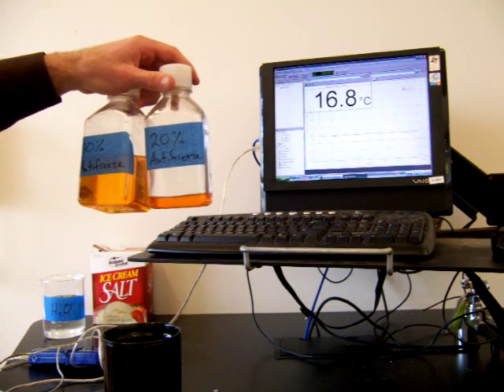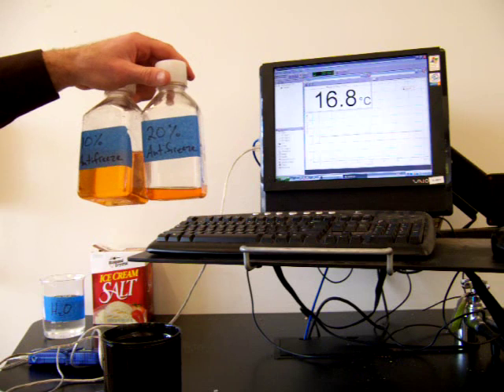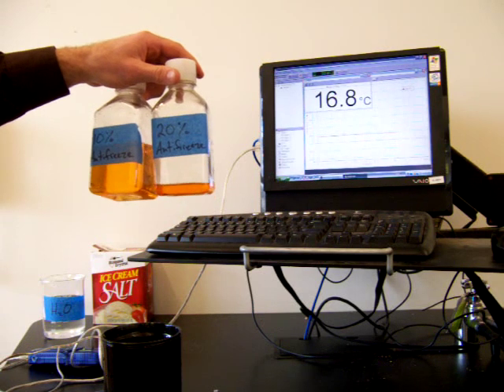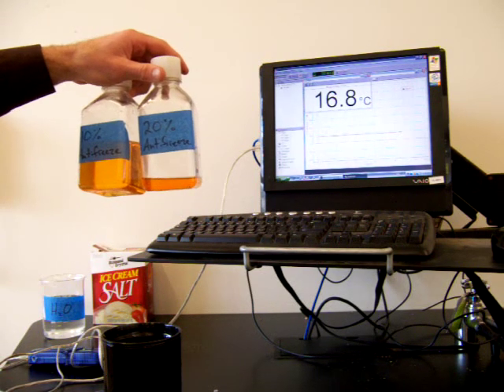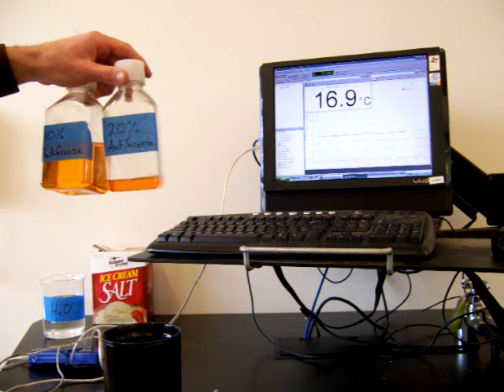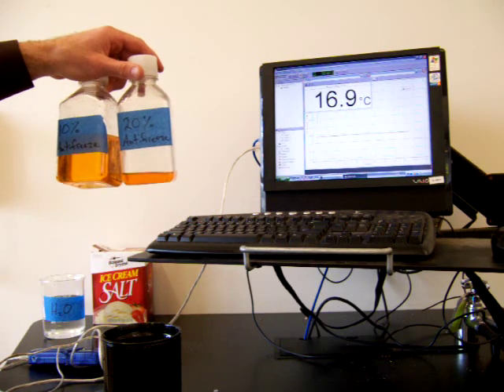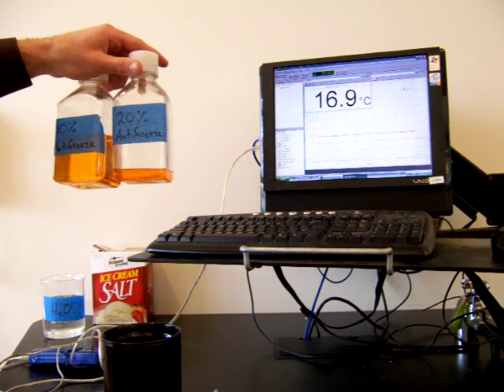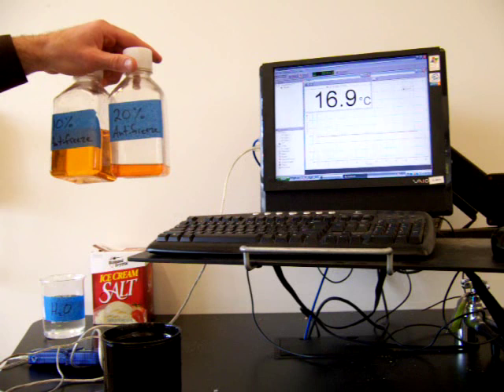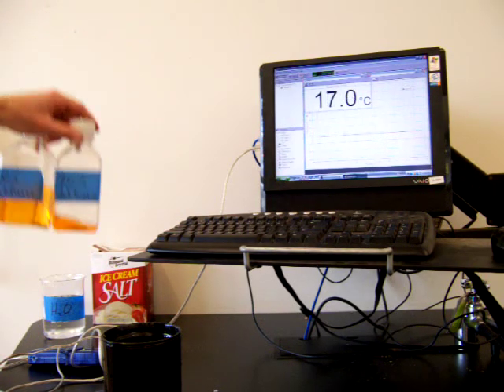And then I have a 20% antifreeze solution which is made by dissolving 20 grams of antifreeze in 80 grams of water. We're going to look at the freezing point of these two solutions and compare them to the freezing point of pure water and use that information to determine the molar mass of antifreeze.